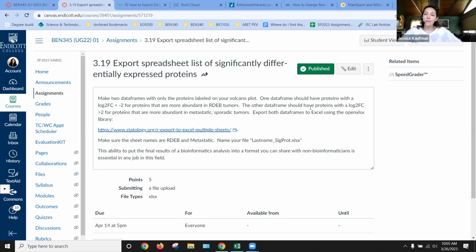As the final step in our proteomics experiment, we have made a publication quality graph. It looks really good. We could definitely submit it to a journal article, but we probably want to share our results with other coworkers who may or may not use R or Galaxy. So the best way to do that is often in Excel.